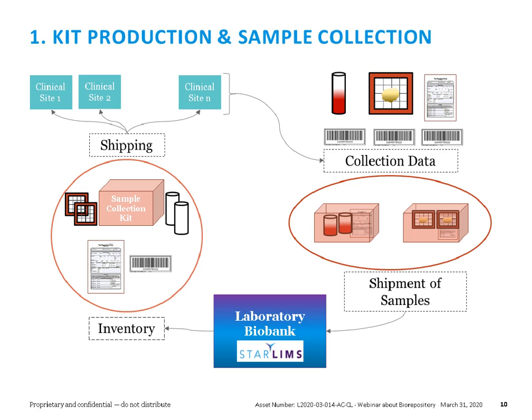The idea is that all of this data at some point needs to be coming to the lab, and these samples are going to be shipped to the lab. And when the shipment of samples arrive to the lab, the LIMS solution should be able to, in this case, if the samples, the kits were created in the LIMS, then we should be able to recognize and reconcile and say, yeah, now we got the kit back. And with that, there could be additional information that the LIMS would know, such as the clinical study, perhaps the time point associated to the kit, and be able to expedite the logging information for the kit that was received.